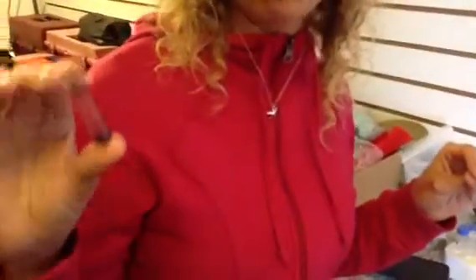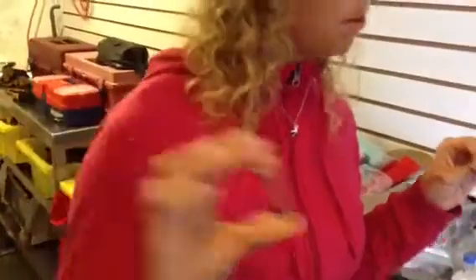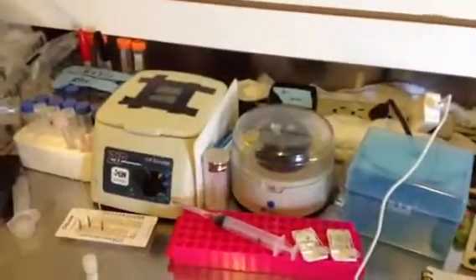All right, so as soon as we have the blood, I'll bring it in here to our onboard lab. I'll put it in one of these tubes, put it in our onboard centrifuge, and spin it for five minutes.